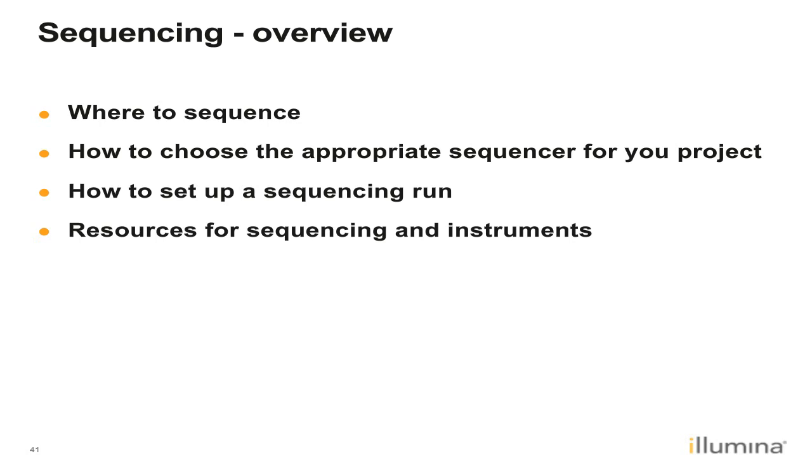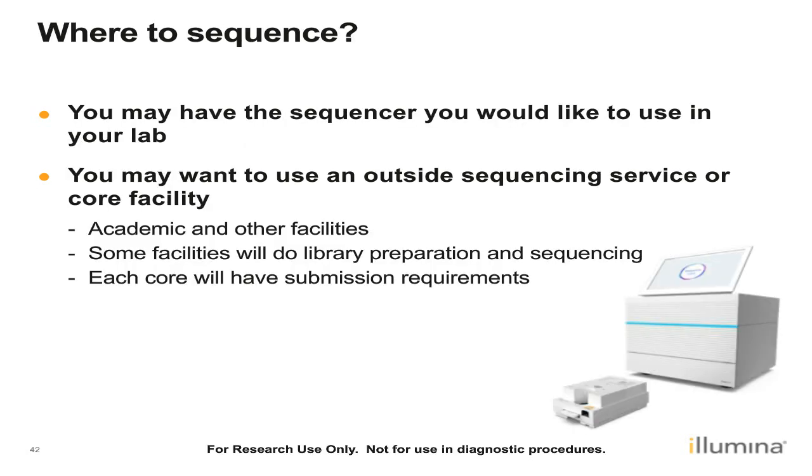Our first question is where to sequence. You may have the sequencer you'd like to use in your lab. We'll discuss more about sequencing within your lab in the following slides. You may instead want to use a sequencing service or core facility. These facilities may be academic or non-academic providers. Each facility will have information on how to submit samples for sequencing, and many offer library preparation services as well.